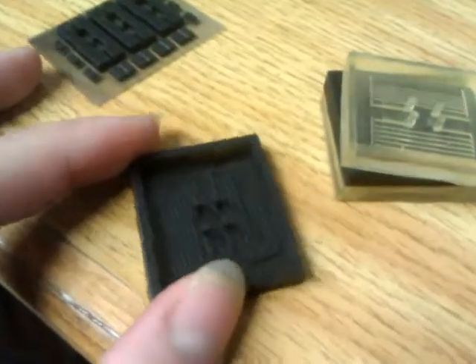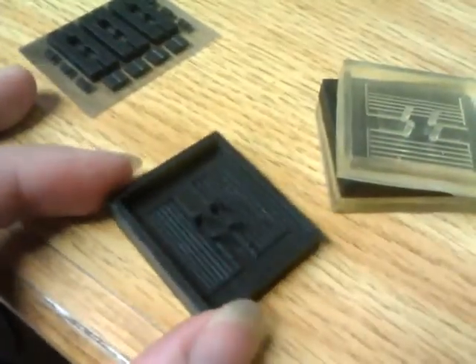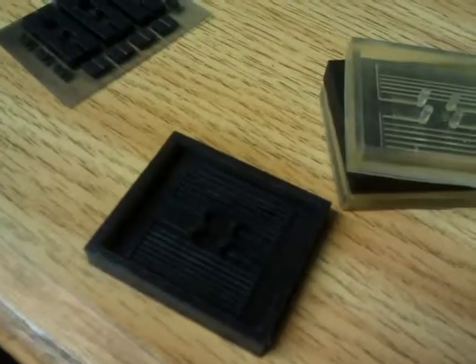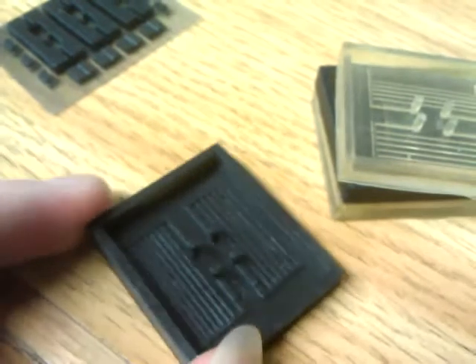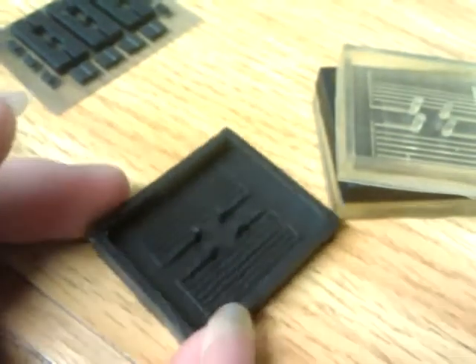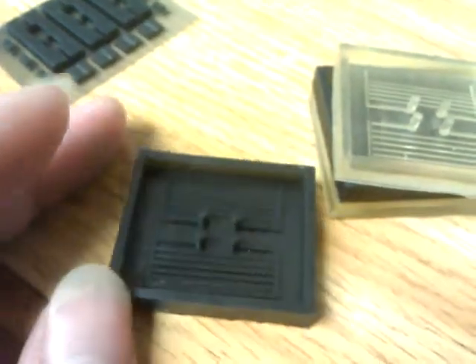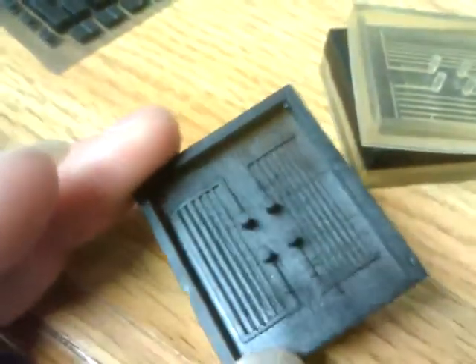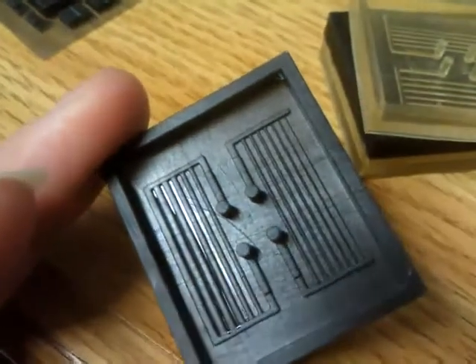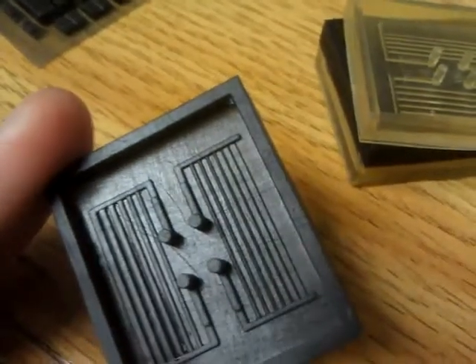We're supposed to pour silicone and let it cure to obtain microfluidic chips, then cover with glass. And we can see how well the material flows inside.